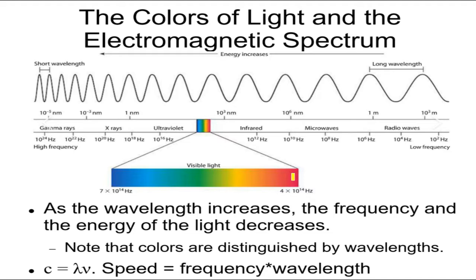Block all these colors, let's say with a filter, and we're going to get blue. We can block all the blue and the green and the yellow, and we're going to get this orange-red. Sometimes light hits something, and what gets reflected to you is only part of the spectrum. That's why things are colored. What we see is when light hits something and reflects to us.